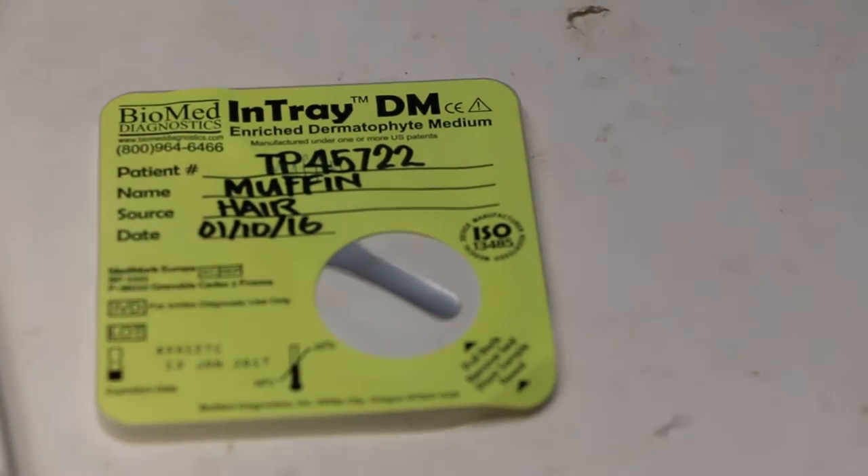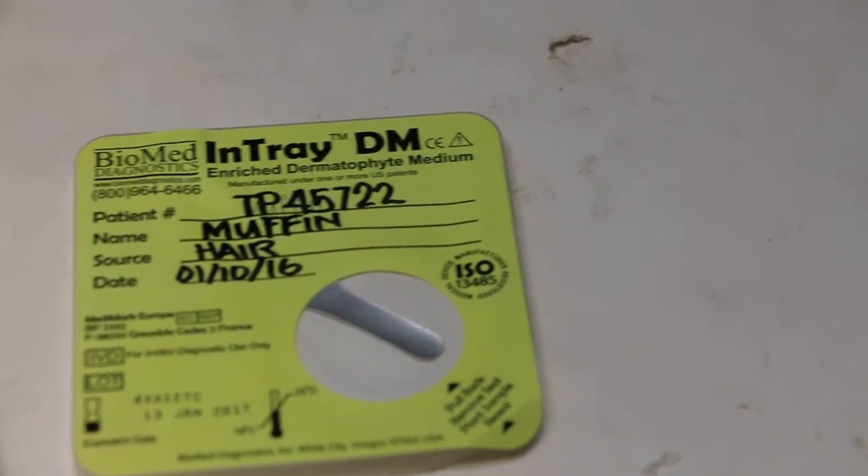Now what she's going to do next: she has already written down the name of the patient and the date on the In-Tray medium. Now the next step is to open the container — remove the seal.